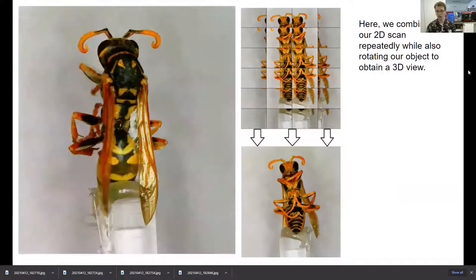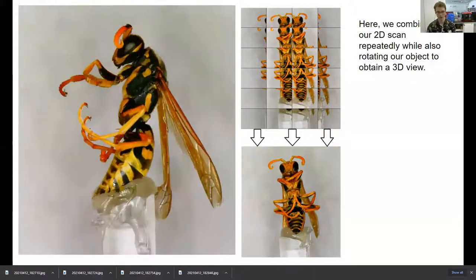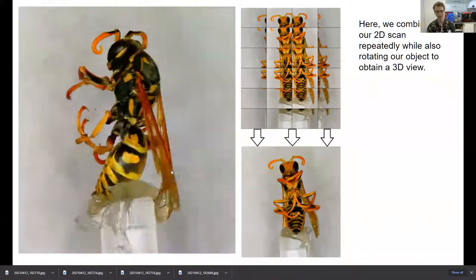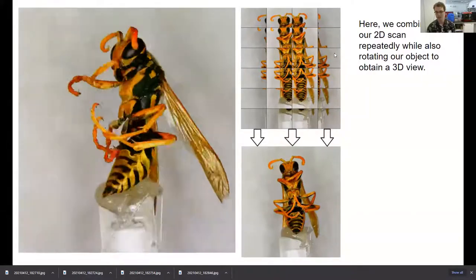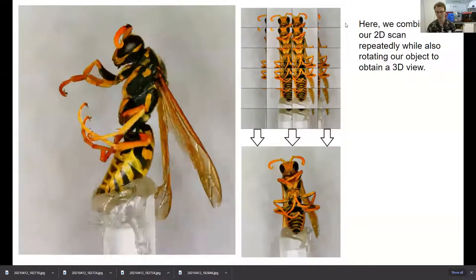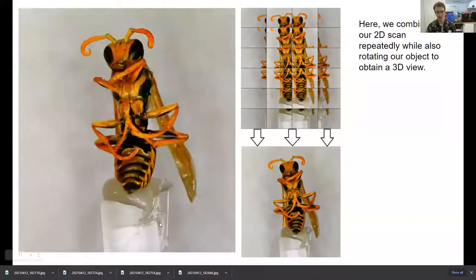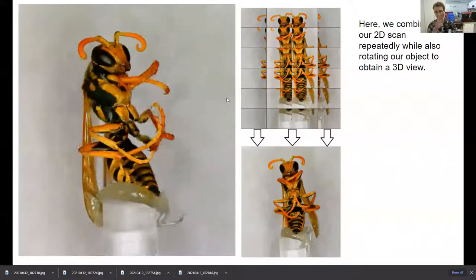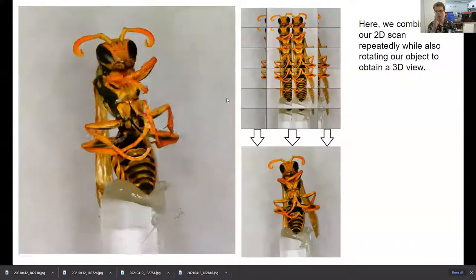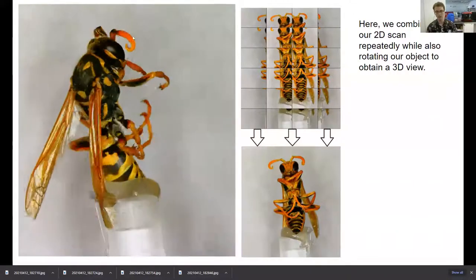Here's an example of 3D imaging once you have that 3D capability. Here's that wasp from before — I'm probably the only person to ever hot glue a wasp to a 3D printed mounting piece. Now I use a needle, but at the very beginning I was impatient and hot glue worked. We did our 2D scan before where we combined many small pictures. Now we're just doing that multiple times — rotating the object a little bit each time and repeating the 2D scanning — to get a three-dimensional view of the object.